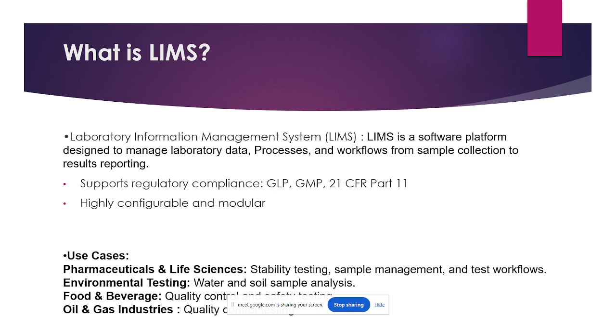That is the basic thing. Whatever required data, we can manage in that application. Okay, what is a laboratory information management system? A LIMS is a software platform. Already I told you, this is one of the software.